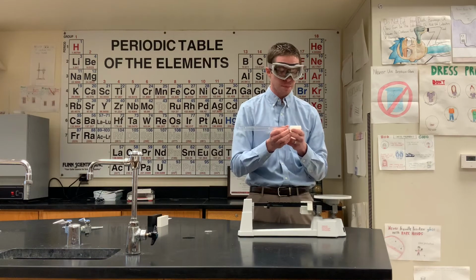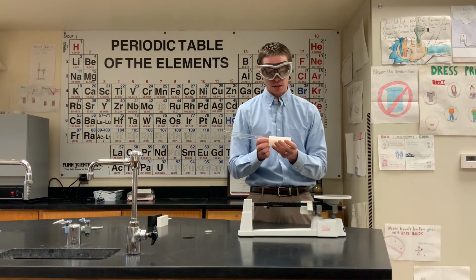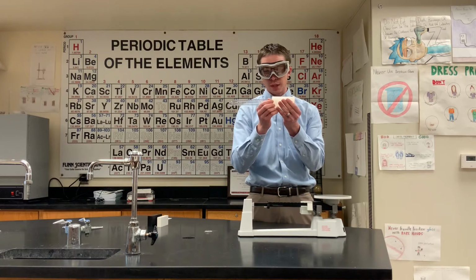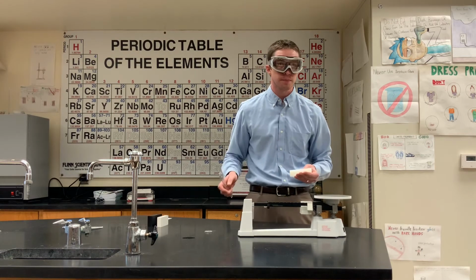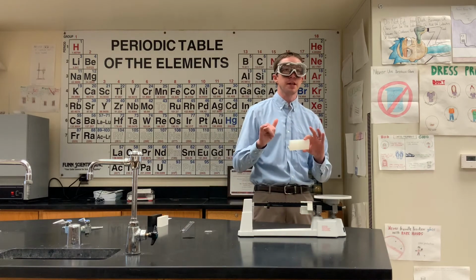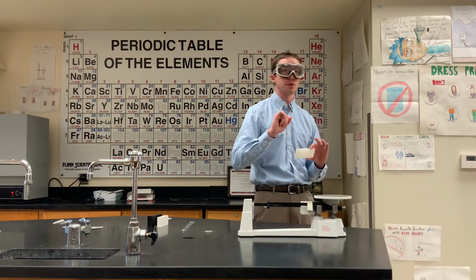For the width, we have 5.19 centimeters. And then finally, for the length here, we have 10.33 centimeters. Okay, so we are going to calculate the volume by multiplying length times width times height, which we will have in the data table for you at the end.